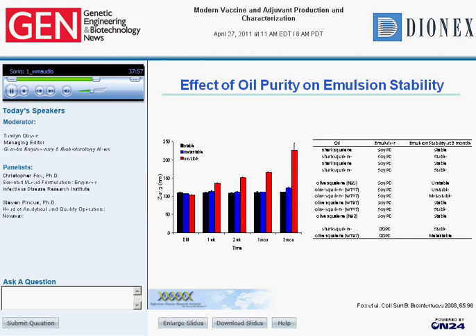So here I'm showing representative particle size data over 3 months for stable and less stable emulsion formulations as determined by particle size growth. So you can see here that the olive squalene emulsions showed some instability compared to the shark squalene emulsions, which were all stable. So this particle size data from dynamic light scattering seemed to corroborate the detection of destabilizing impurities in the olive-derived squalene detected by HPLC CAD.